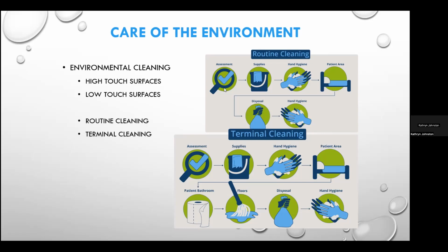They should concentrate on those that are frequently touched, like I just talked about. And then even in the laboratory, unless there is a spill, there is no need to use a disinfectant on the floor. The floor just needs to have a detergent to remove the dirt and grime that can trap microorganisms.